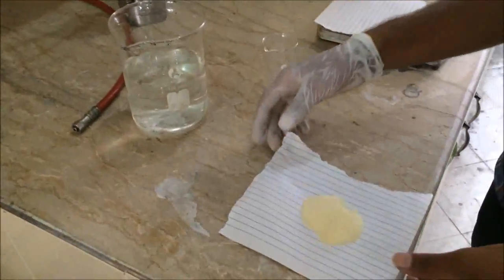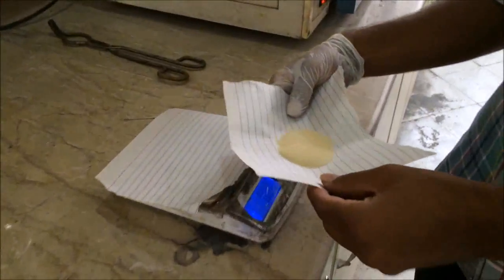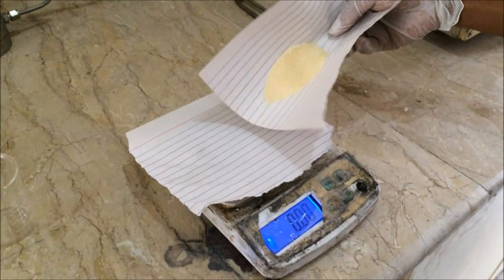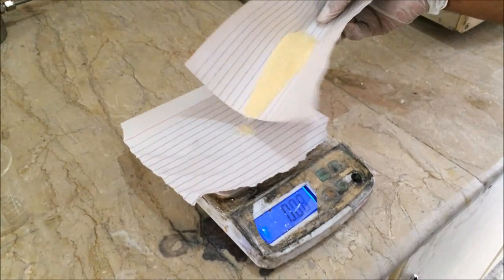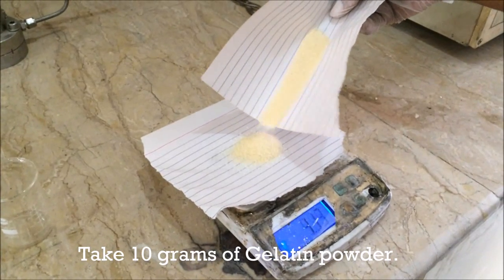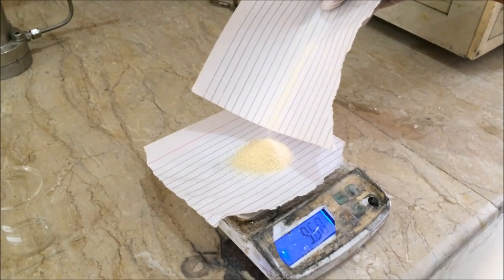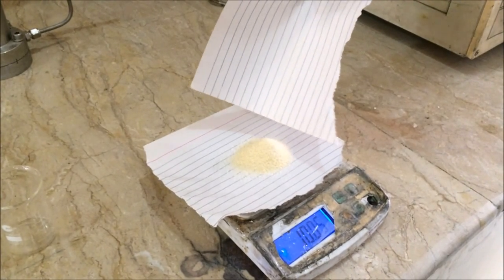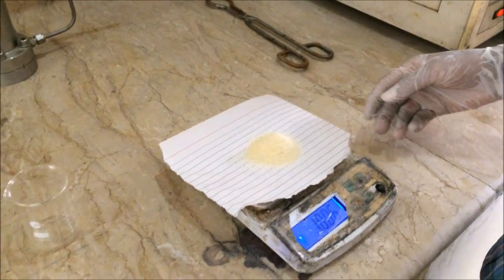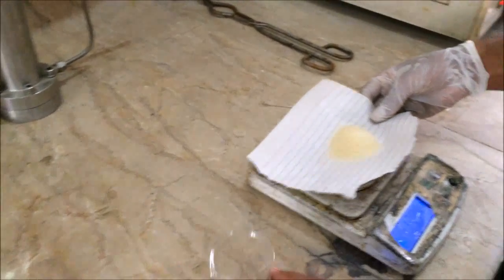First, we have to weigh the gelatin powder to 10 grams using the weighing machine. Here you can see that it is almost 10 grams of gelatin. Now we will put the gelatin into our beaker.